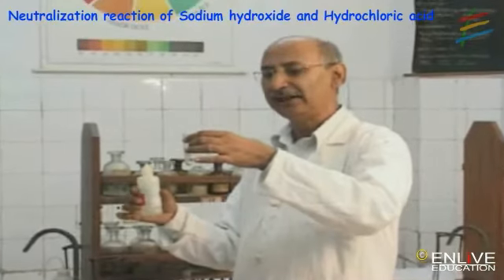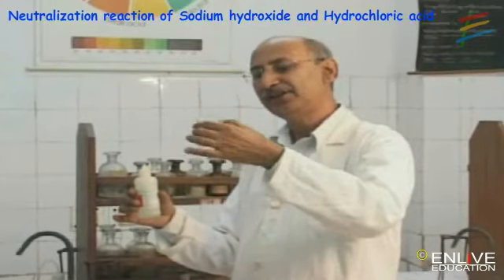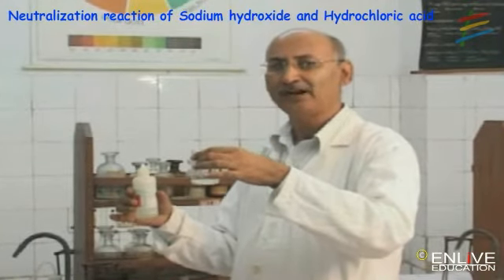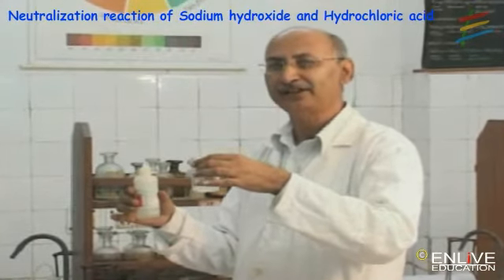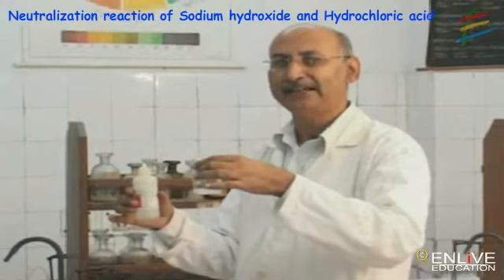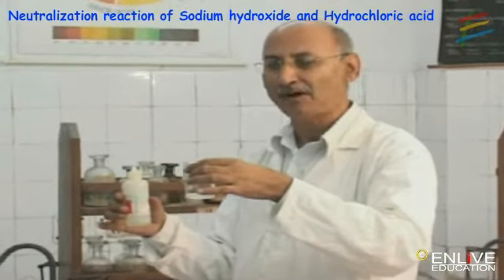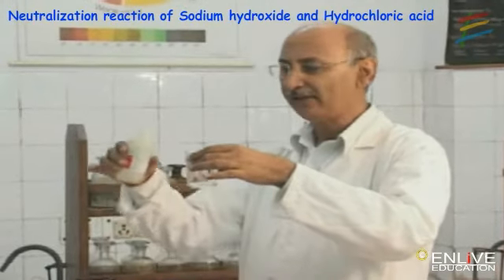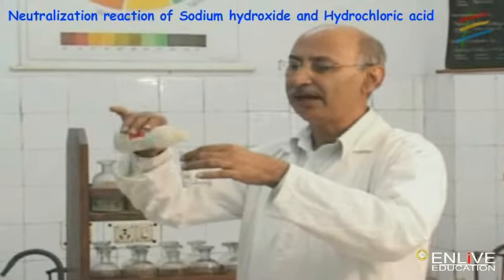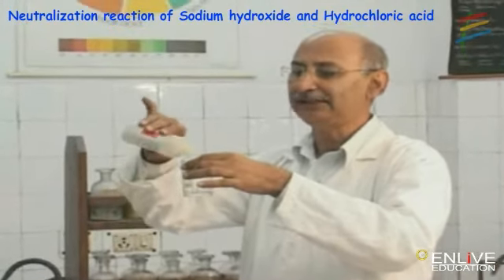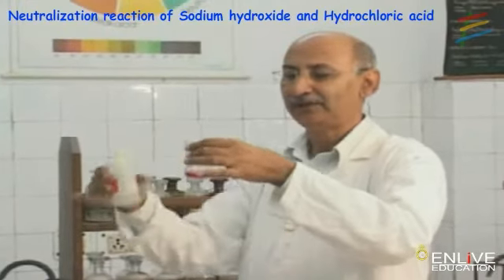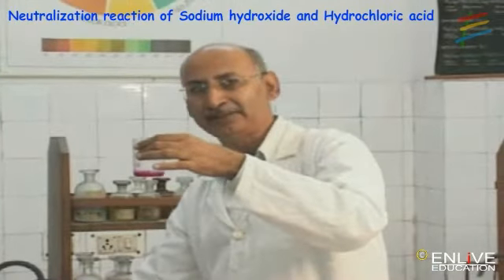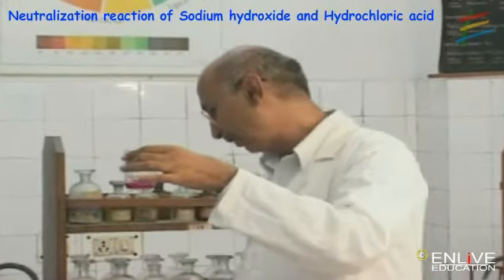Now we are going to take a neutralization reaction of acid and base to form salt and water. I am going to add phenolphthalein. We have added a drop of phenolphthalein and it becomes pink in color.